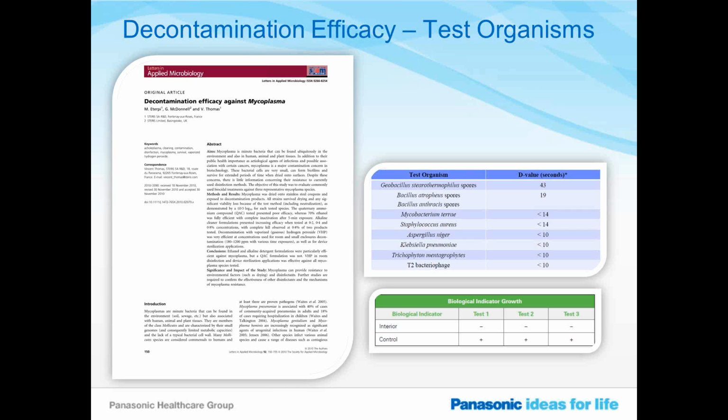There are a lot of key contaminants like Mycoplasma, Staph aureus, various yeast and mold species. Stearothermophilus is a big one because it's thermophilic. So our advice from a technical level is, regardless of which technology you choose, make sure the efficacy is really proven for some key organisms that you would actually experience in contamination.